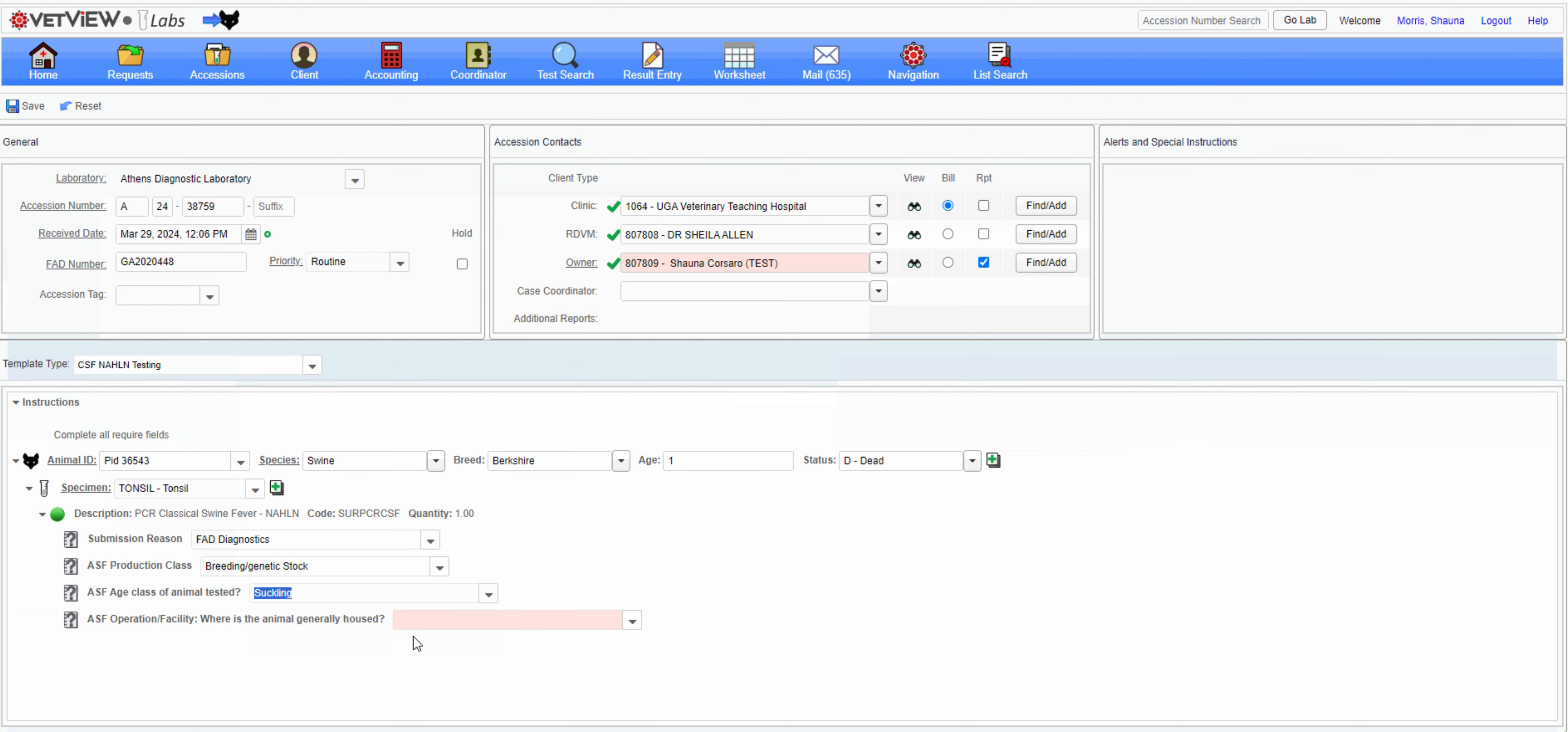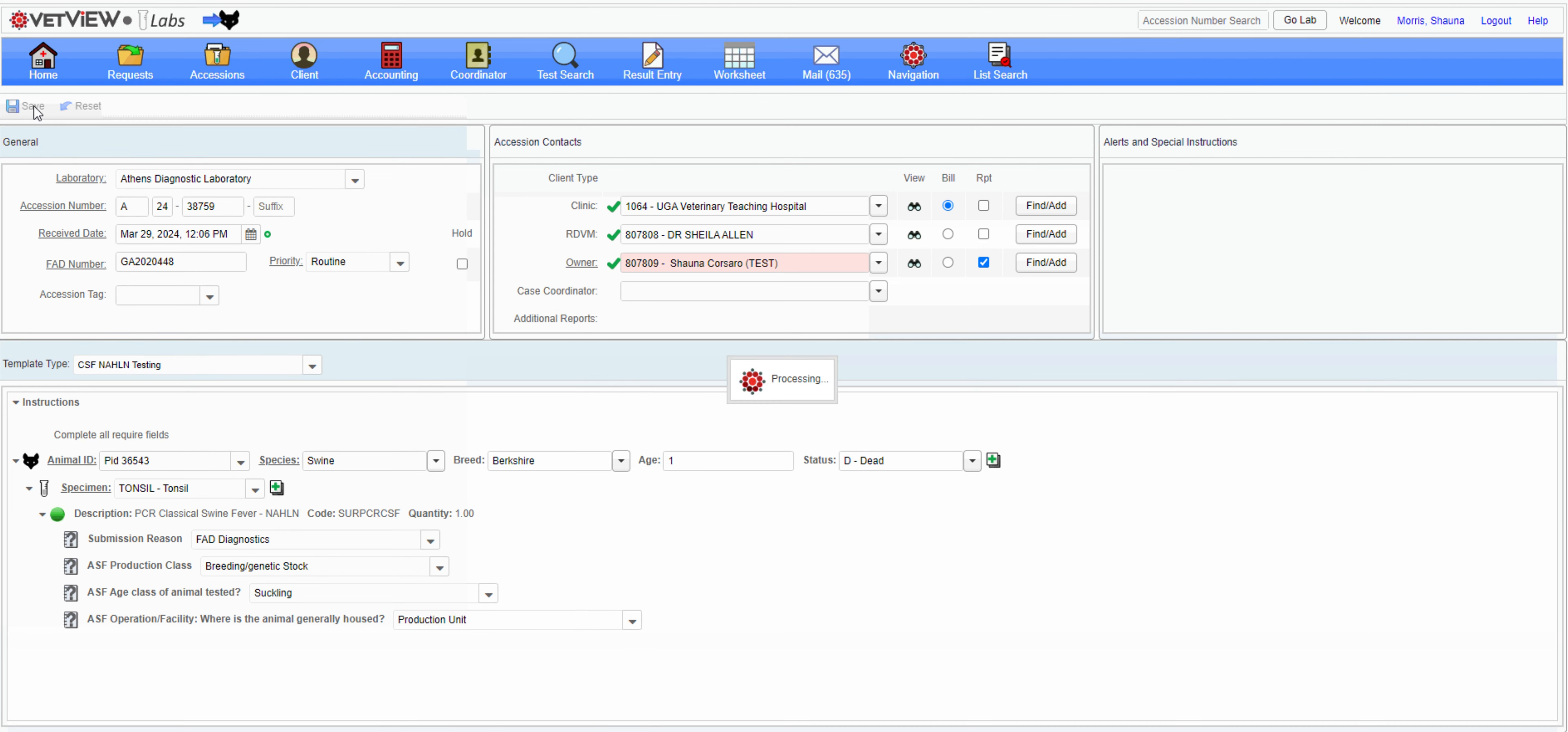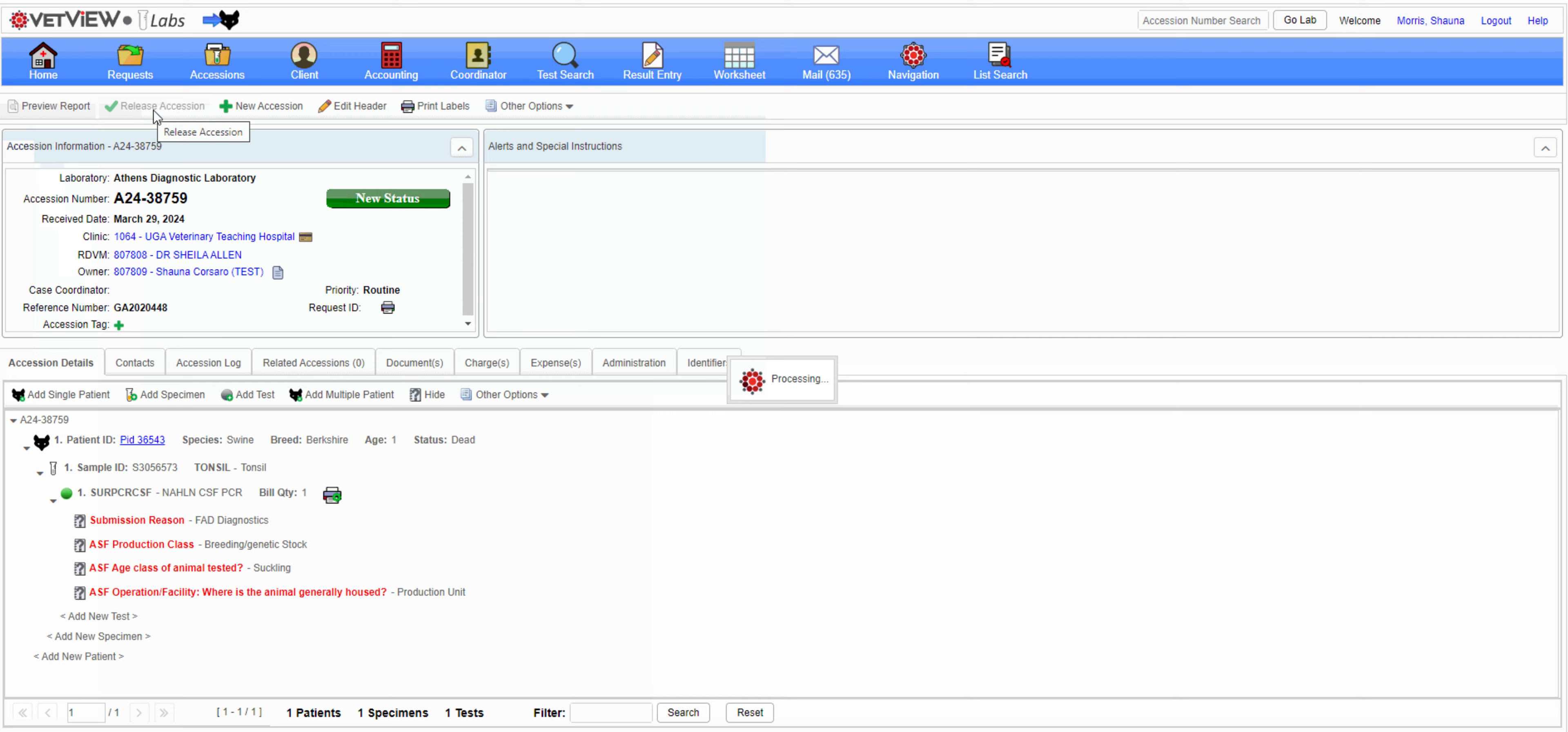Once all fields have been completed, you can save and release the accession for result entry by the laboratory.